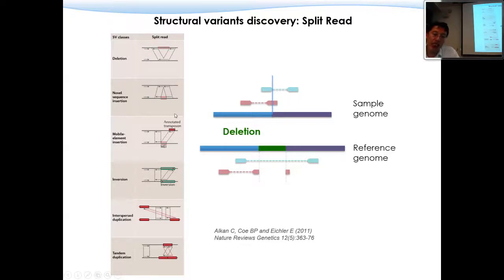And in this case, that will be annotated as transposons. So you can see that this transposon element is actually jumping into here. And then if you map it, one end is here, the other one is mapped to here, but actually it's the transposon element. If you only rely on this one particular read, you may calculate this as a deletion. So you need to pair those with the other regions in terms of the overall reads. But you can see this is a type of event that could happen as well.